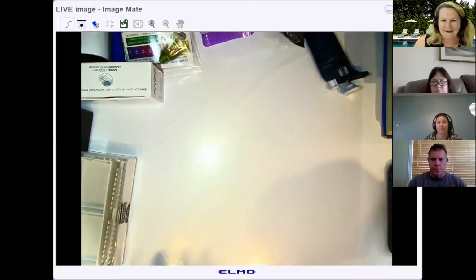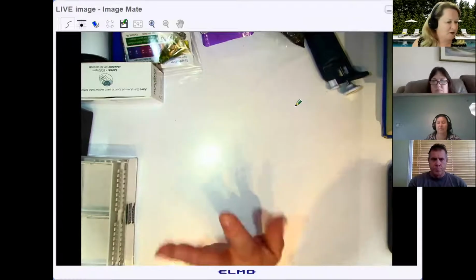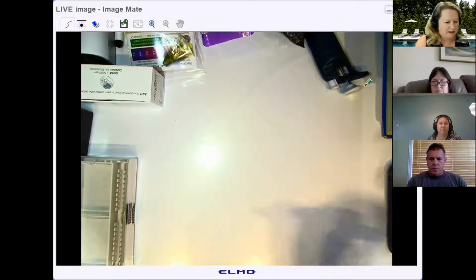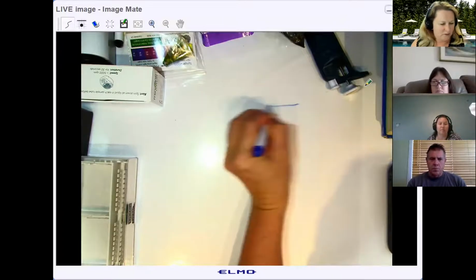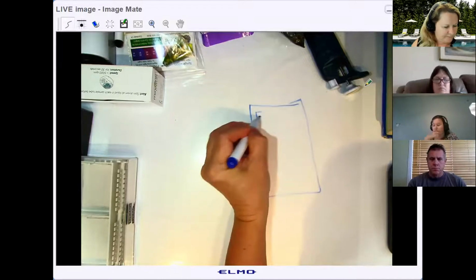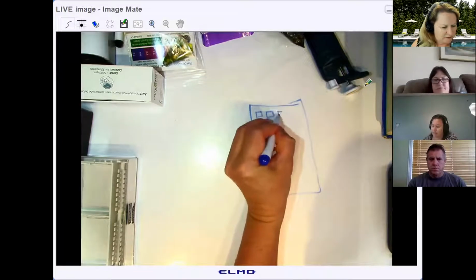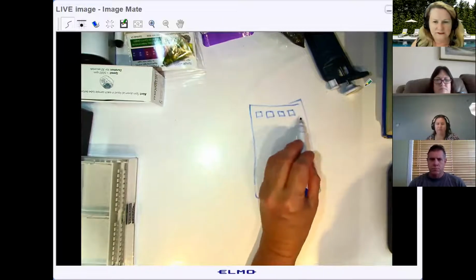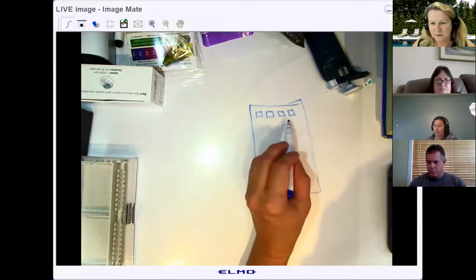Okay. All right. Great. Okay, so I'm going to share my screen here, and just a little background information about gel electrophoresis. What you do, you have the kids pour an agarose gel, and in the agarose gel, you use a little setup that makes a few little holes at the top, or wells, and that's where you're going to put your DNA.